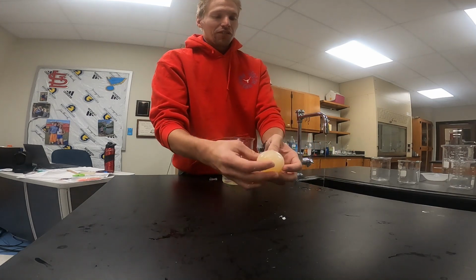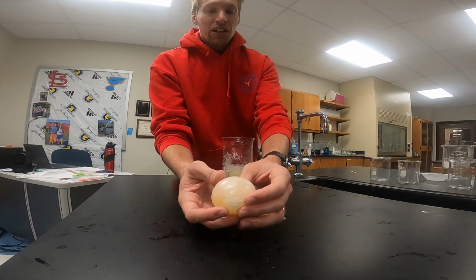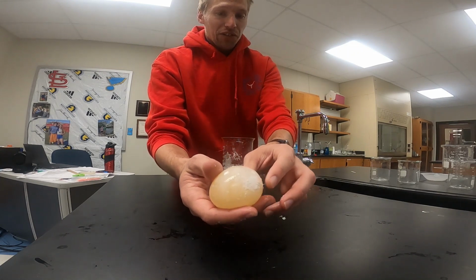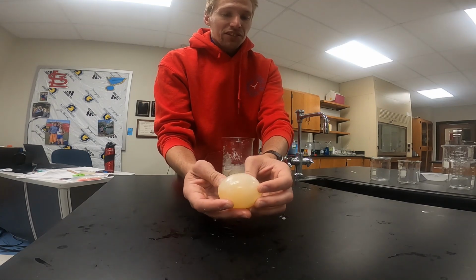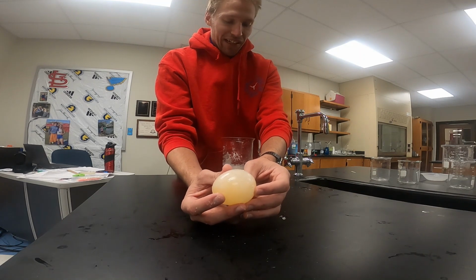I'm rinsing the first one off now, and you can see we have this egg without a shell. It's kind of a rubbery feeling because it doesn't have that hard shell. We're going to take this first egg over the scale and weigh it, and then place it in a beaker of water and let it sit for at least 24 hours, and then come back and take the mass afterwards and see what it looks like.